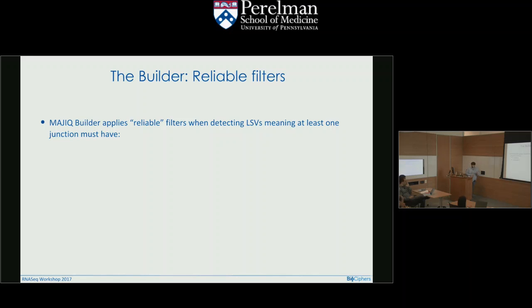So these are parameters that you could tweak. With some testing, these were the ones we settled on. But for your data that might be higher or lower coverage, maybe you want to alter these and play around with them a little bit.